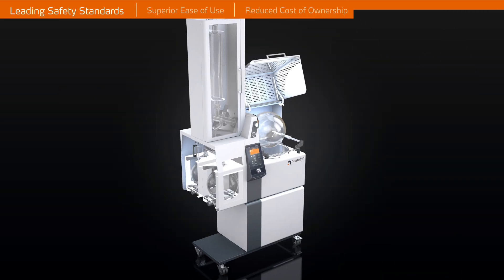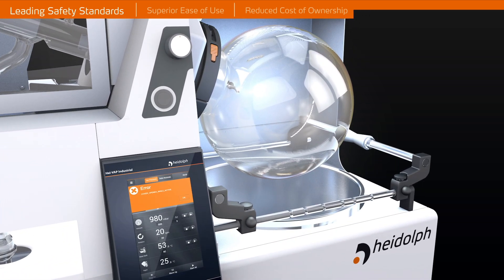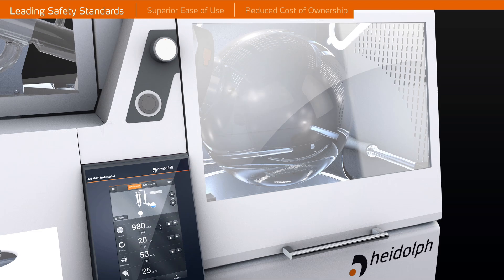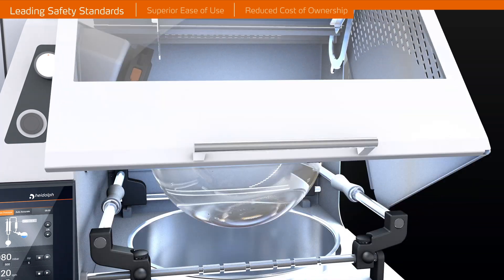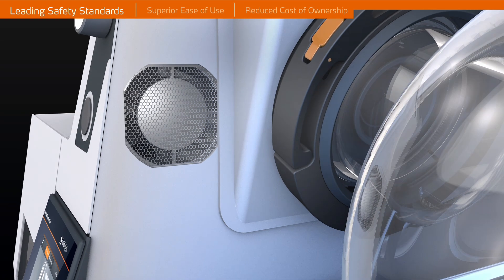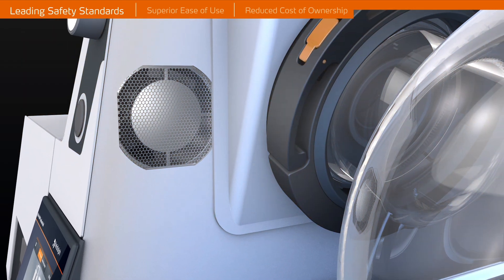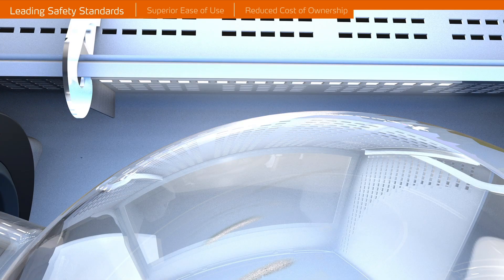Leading safety standards. A metal-framed guard hood with protective safety glass encloses the bath, resulting in user protection from steam, splashing bath fluid, and shards of glass in cases of accidental flask breakage. Clear and visible monitoring of the evaporation process is achieved with the use of non-fogging tempered safety glass, internal ventilation fan, and an integrated LED light.